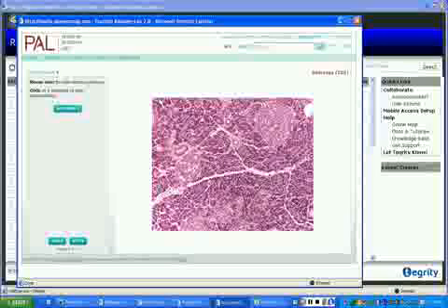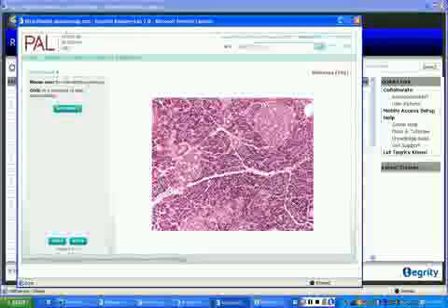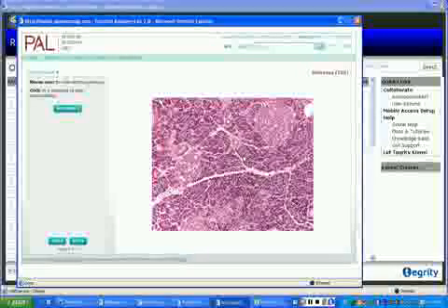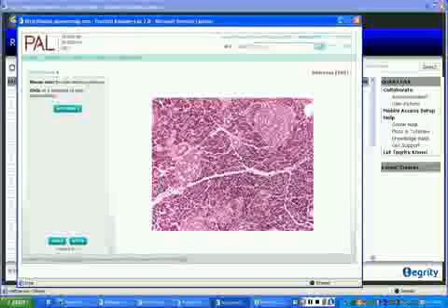Hollow, empty. It's got a hole in it. See how this one's got a hole right there in the center? See how there's no hole in this one? It's nice, solid. That has a tube, a hole, tube. Okay. Here's how you know. If it's got red blood cells in it, it's a blood vessel.